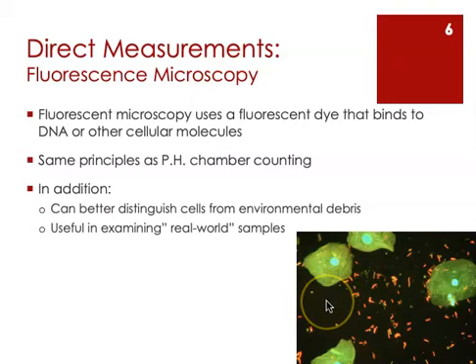On the lower right-hand side of this slide, you're looking at a specimen that was prepared for use with a fluorescent microscope. There are cells present, these bright green structures. These are eukaryotic cells. I know that because you can see a nucleus, a light blue nucleus inside each one of these cells. And then around those cells, there are these much, much smaller, sort of orangey red colored structures.